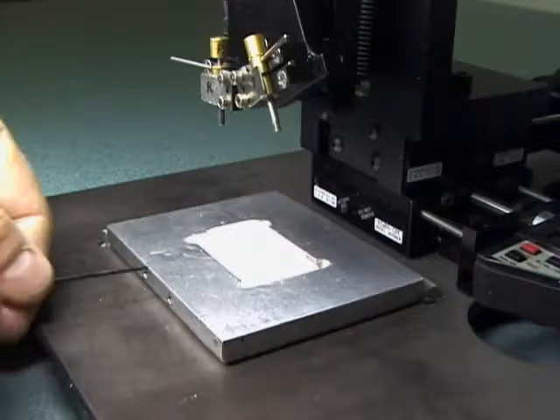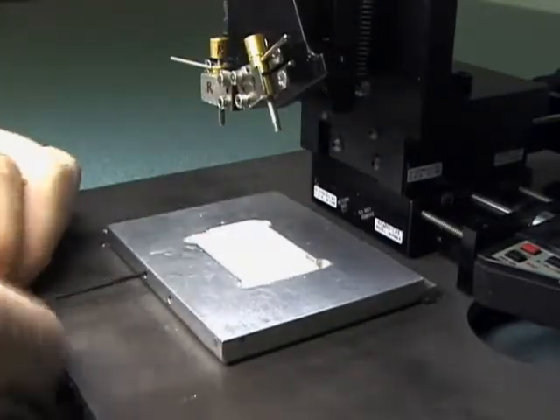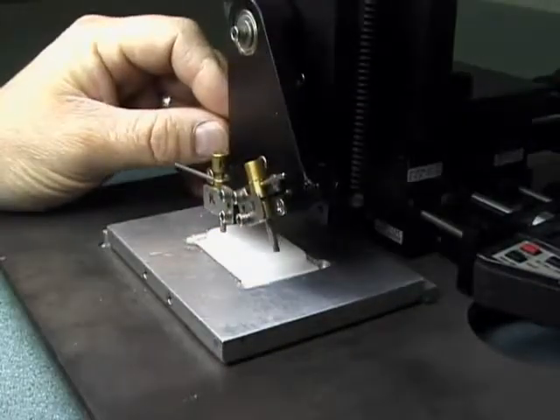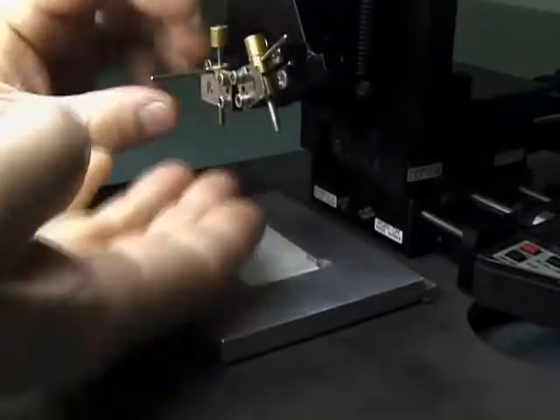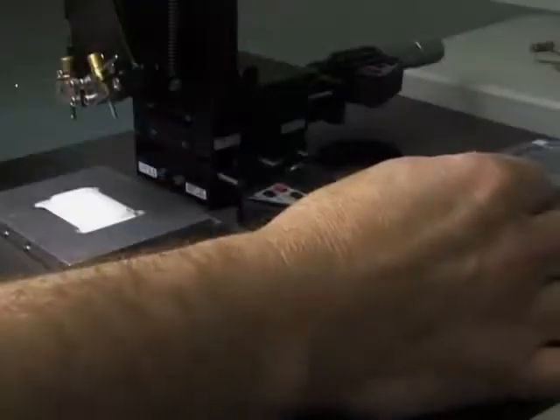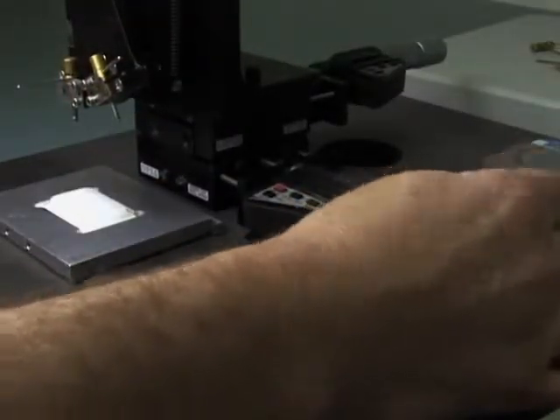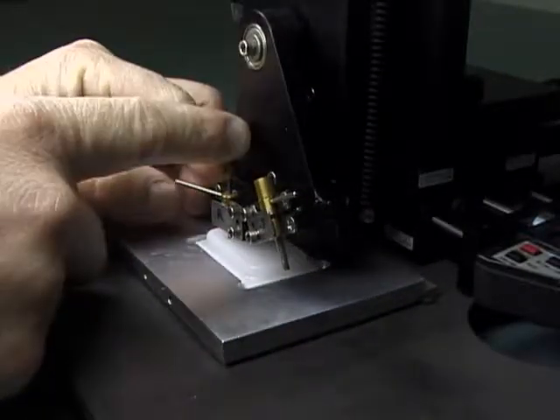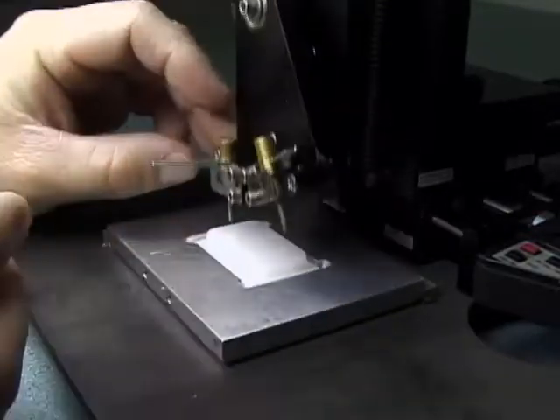Hopefully you've already moved the micrometer guide to the number one punch position beforehand. Working quickly, lock the block down and begin punching. Punches are 3 millimeter apart from each other. Punch as many holes as you can at a time. 6 to 10 holes is about max before the paraffin cools. Remember to stop punching when you've reached the limit to your micrometer gauge. You can punch the last third of the block later.